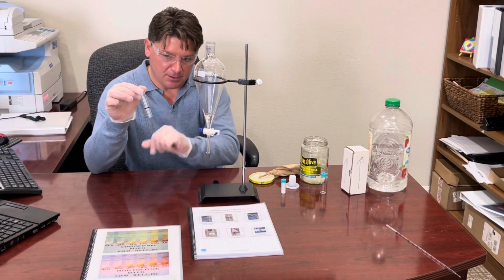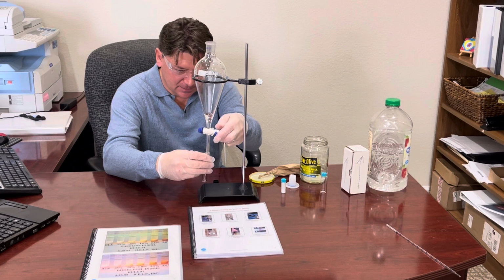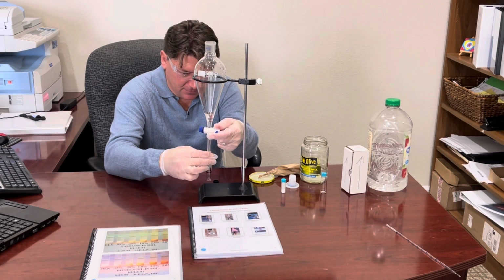Now, we are going to deal with our test tube. There's a black scribed line on the test tube which represents 4.2 milliliters. We're going to release our extract solvent up to that scribed line.